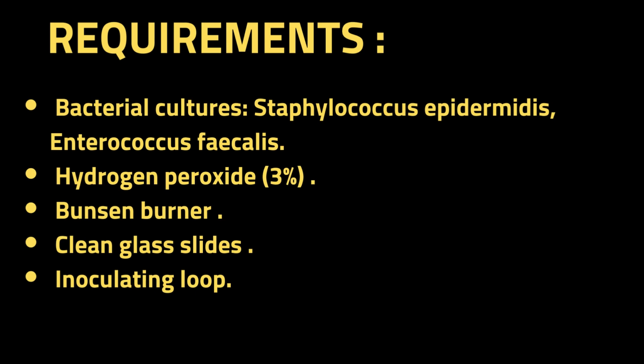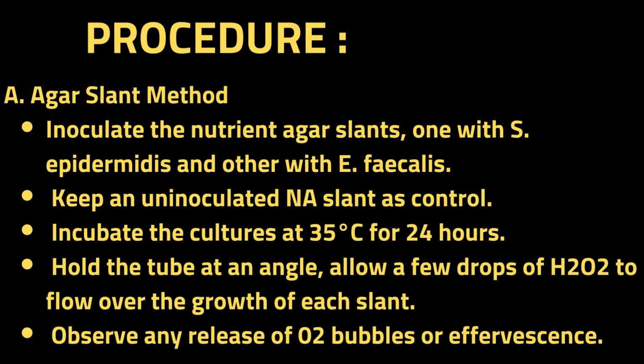Requirements. Bacterial cultures: Staphylococcus epidermidis, Enterococcus faecalis. Hydrogen peroxide, 3%. Bunsen burner. Clean glass slides. Inoculating loop. Procedure. A. Agar slant method.